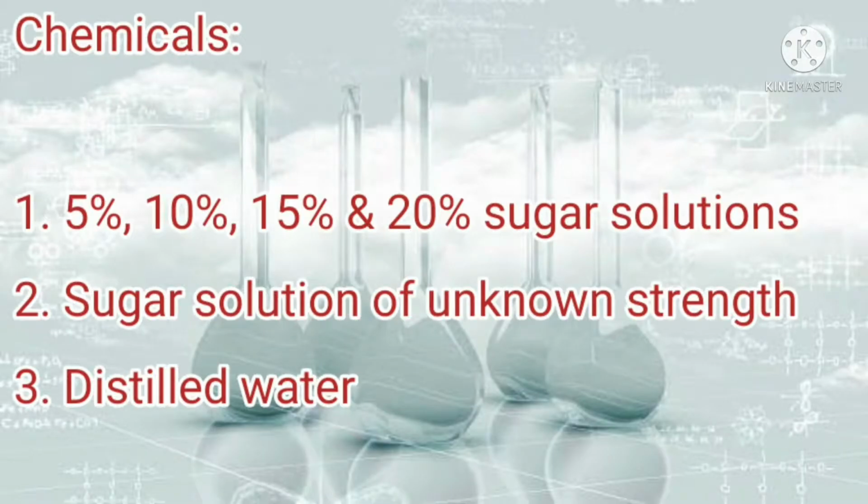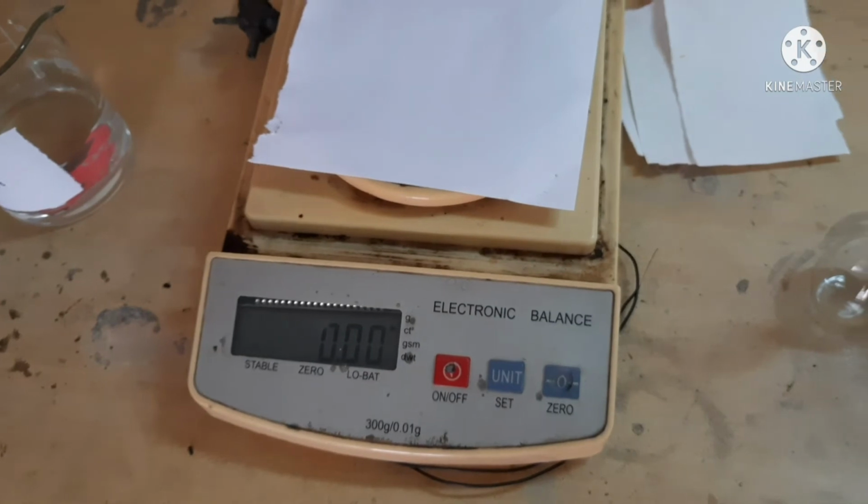For this experiment, we need sugar solutions of strength 5%, 10%, 15% and 20%, and a sugar solution of unknown strength and distilled water.